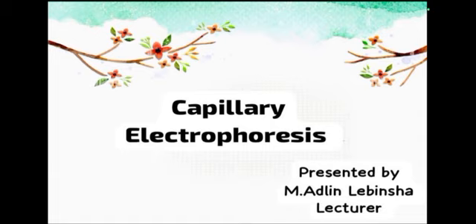Today's topic is capillary electrophoresis. Previously we saw the introduction of electrophoresis, its types, and the paper electrophoresis and gel electrophoresis. Today we see about capillary electrophoresis.